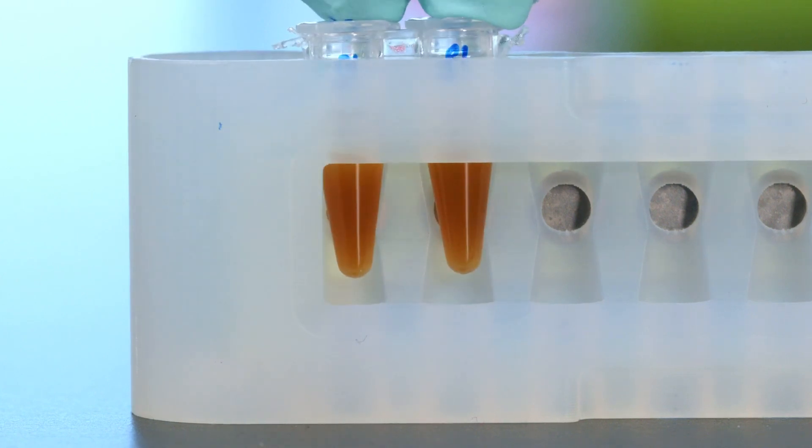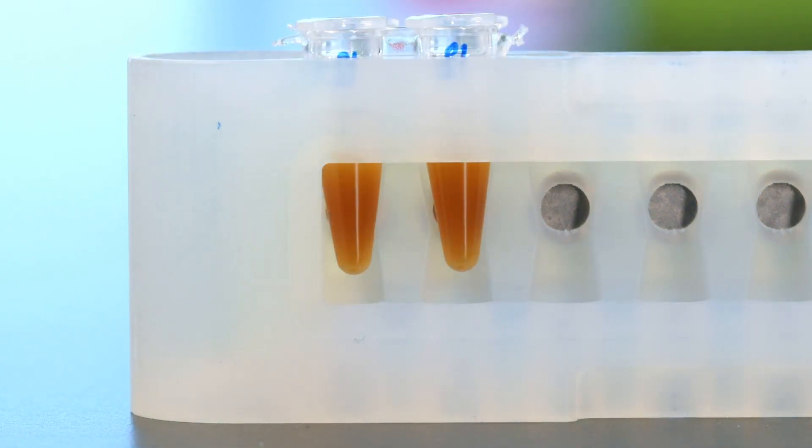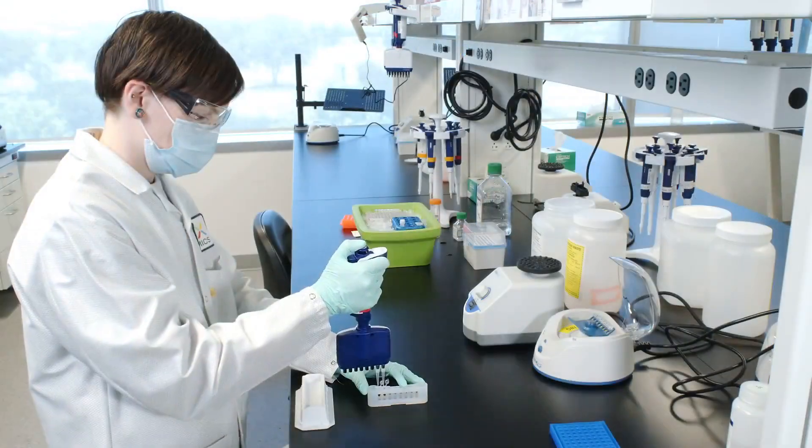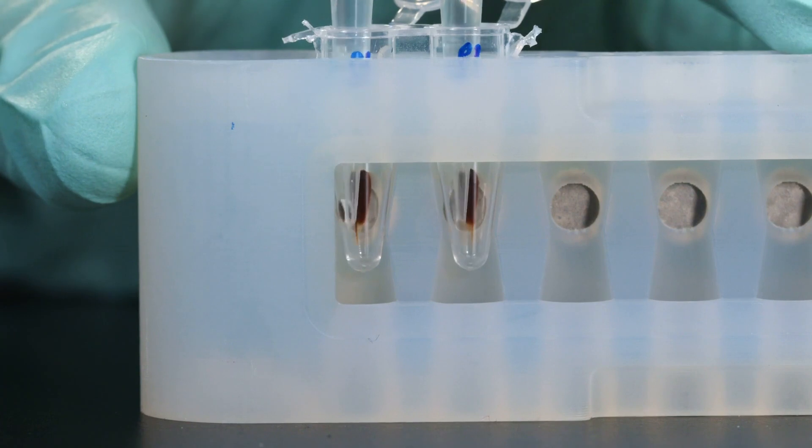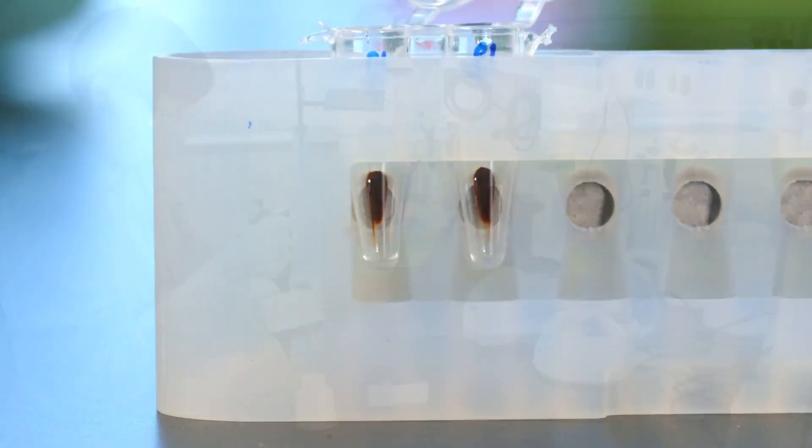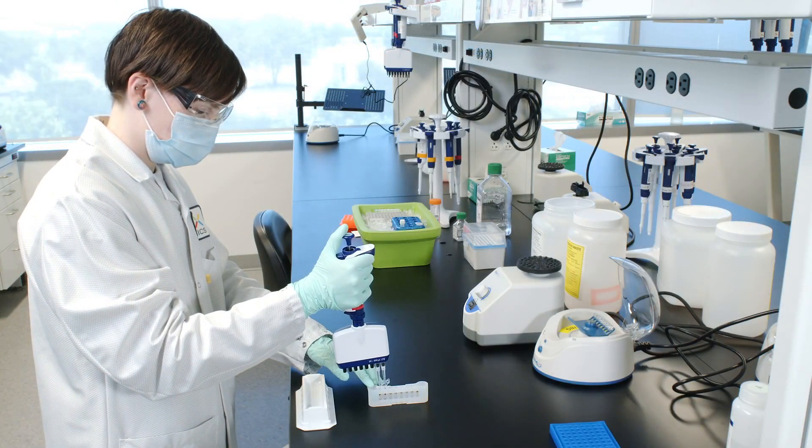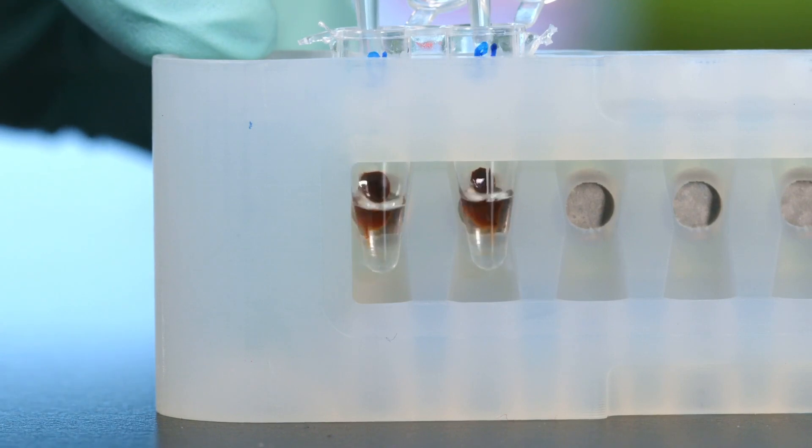Remove the supernatant. Add 200 microliters of 80% ethanol to the pellet.